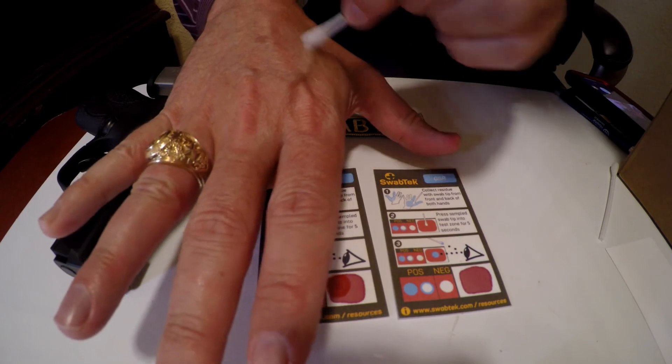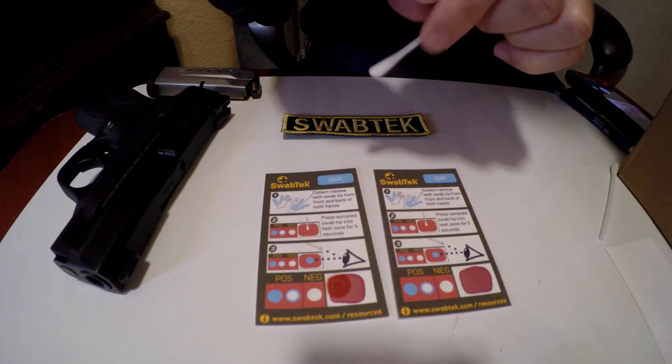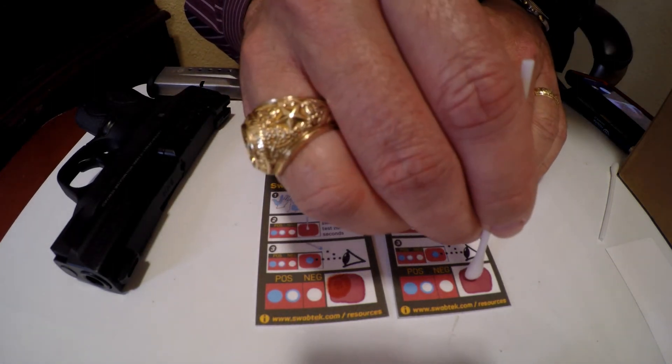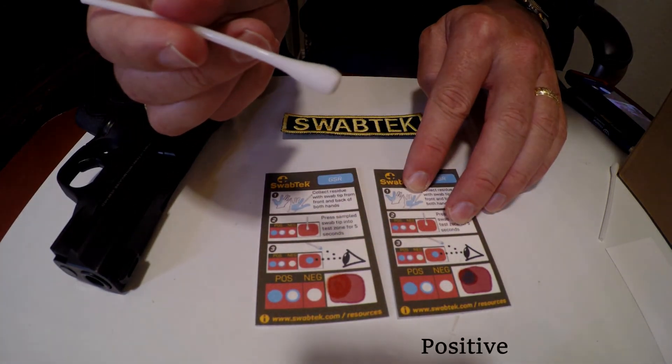Now let us show you a positive. Collect with the tip of the swab. Apply the swab to the reagent zone. If you see a blue ring, you have a positive result.